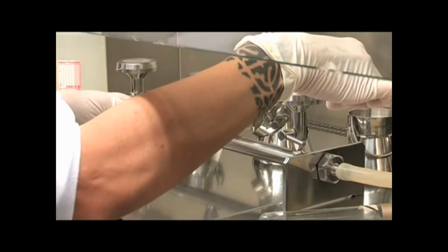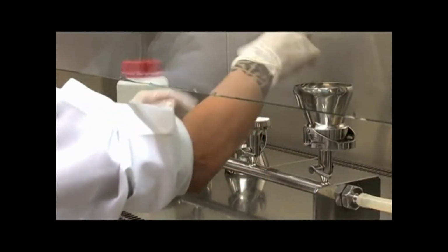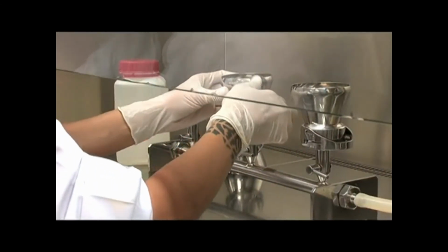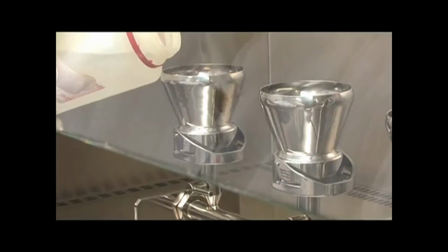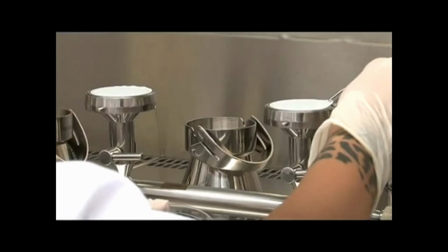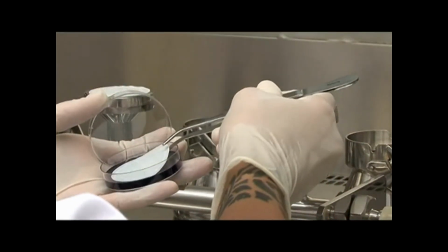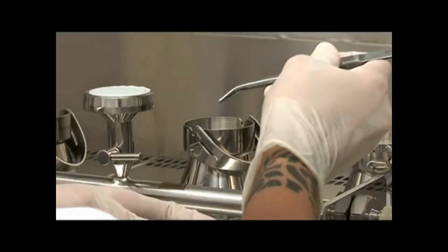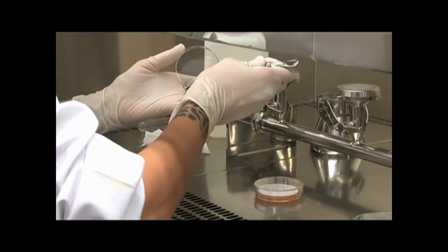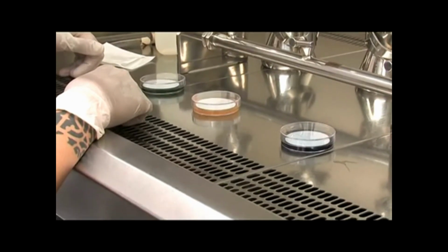With the help of sterile forceps, place a 0.45 micron filter on the filtration apparatus, holding the grid pattern upward. Take 100 milliliters of sample for each test and vacuum filtrate it. Again, with the help of forceps, remove the filter and place it on the plate, holding it in the same position and avoiding the formation of air bubbles so that there is complete contact between the filter and the plate.